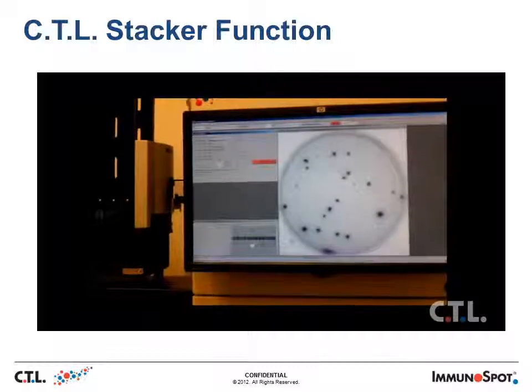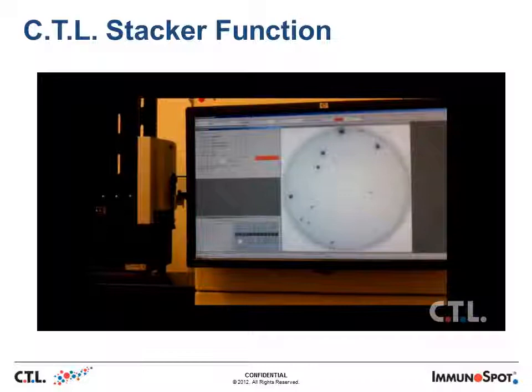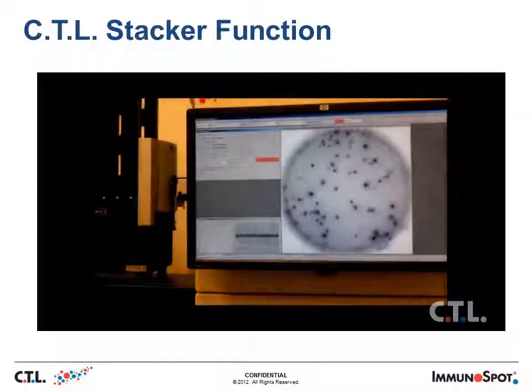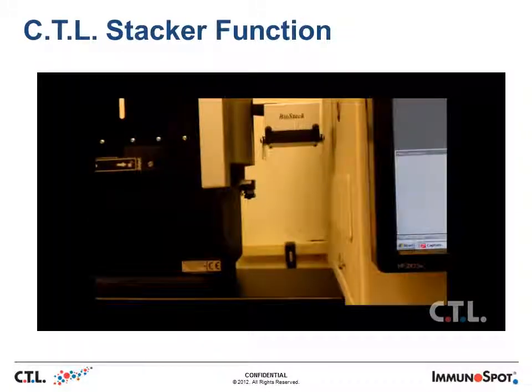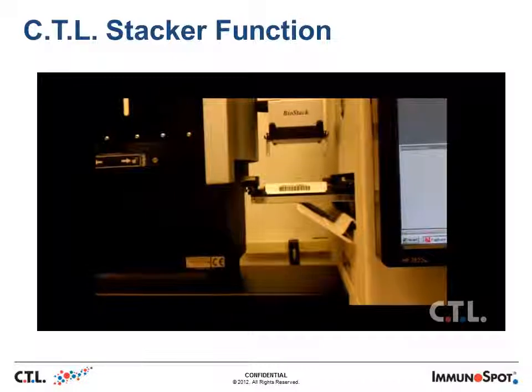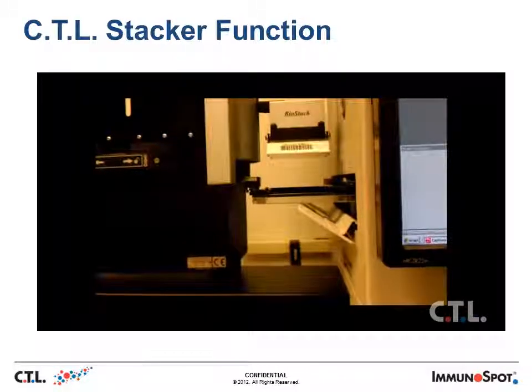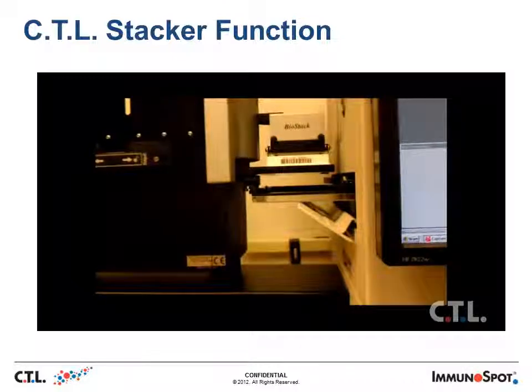And as you can see, the scanner is going from well to well. Once it has scanned all of the different samples in all the 96 different wells, it ejects the plate out, at which point the stacker then picks it up and places it back to the original position that it came from.